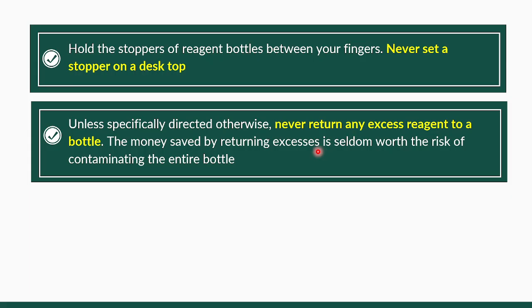Okay. Next, we have here, unless specifically directed otherwise, never return any excess reagent to a bottle. Now, the money saved by returning excesses is seldom worth the risk of contaminating the entire bottle. So, dili pwede nga ang mga sobra sa atong mga chemicals, especially katong wala pa natunaw, kay balik na to sa sudlanan.